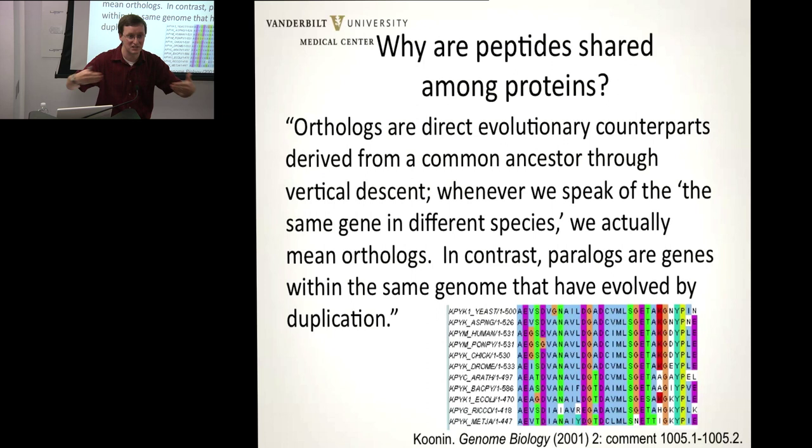Lots of species have gone through genome duplications over time that have led to multiple variants of a particular gene being found throughout the genome. So both of these causes may lead to this. If you're using a multi-species database like all of SwissProt to do your searching, you will assuredly hit proteins outside your species of interest just through the orthology problem. But even if you search within humans, you're still going to find multiple copies of genes in some cases.